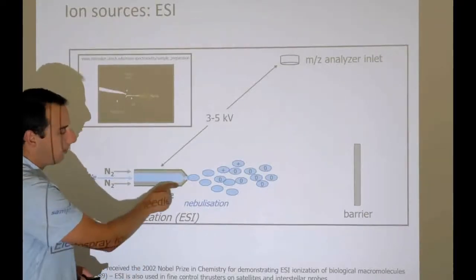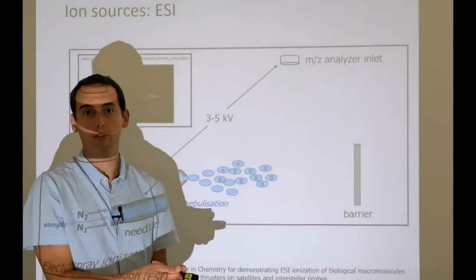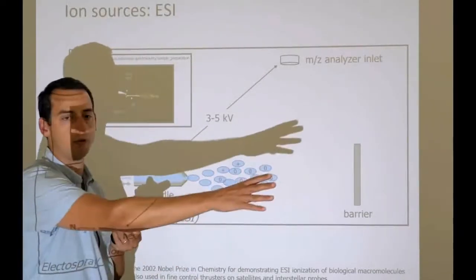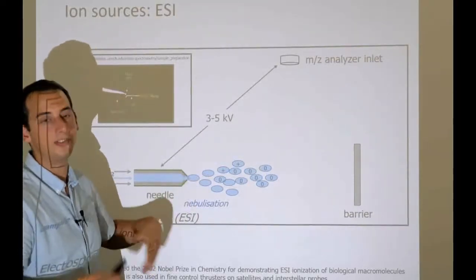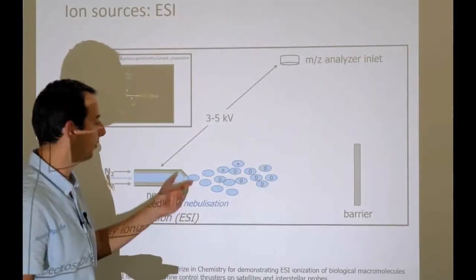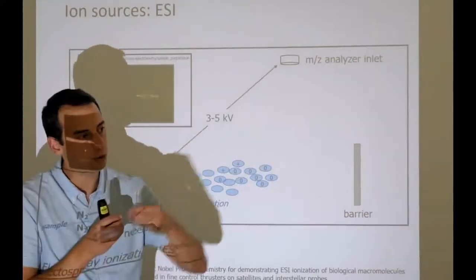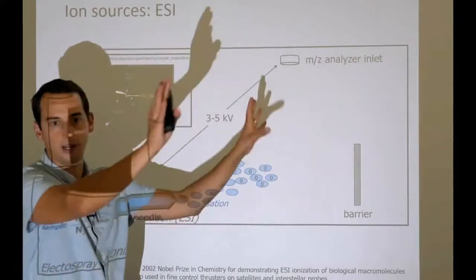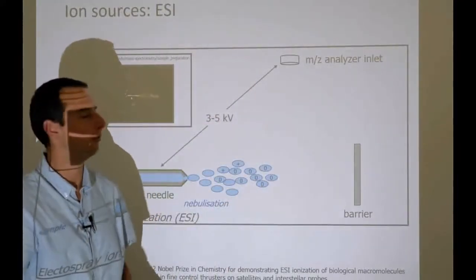The bottom line of what happens is the same thing that happens when you squeeze a garden hose when water is coming through it. Instead of a pure flow of water, the water flow now has to speed up to keep the same flux. This increased kinetic energy will translate into the ability to overcome surface tension, and instead of a stream of water, you're now going to have a spray of water. It's a very common thing, and again, when you've pressed the garden hose, you know how this works.